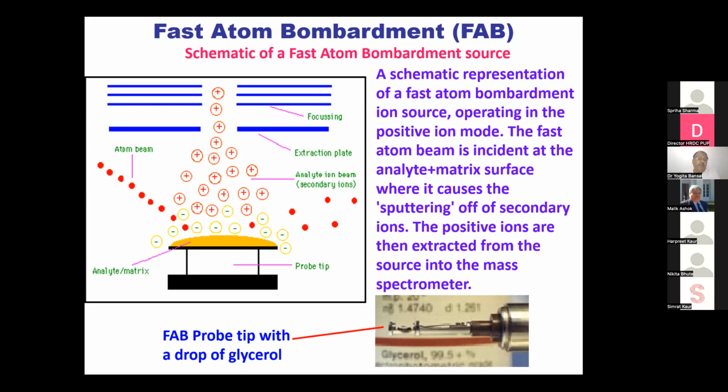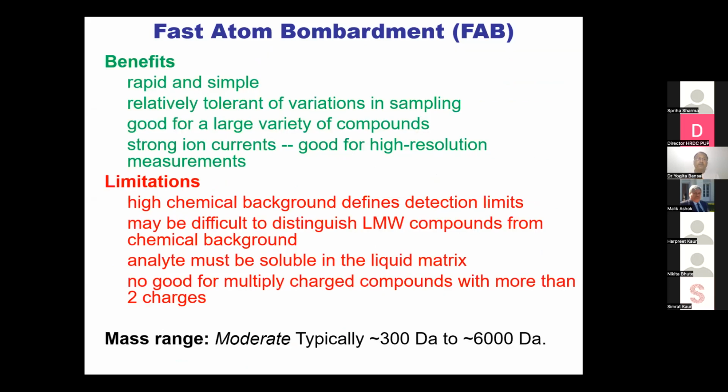So it may be difficult for us to know the molecular mass. But if we want to see the fragmentation pattern only, then we can go for the hard ionization techniques, because the fragmentation pattern can be seen only when the molecule is fragmented into different fragments using these techniques. But if our target is to identify only the molecular ion, not the fragments, then we have to go for the soft ionization techniques.